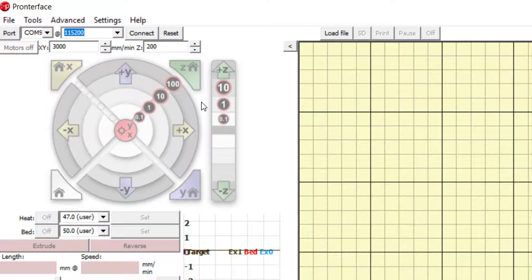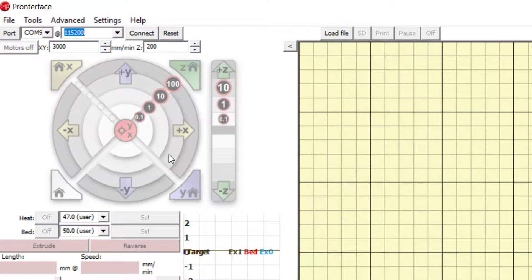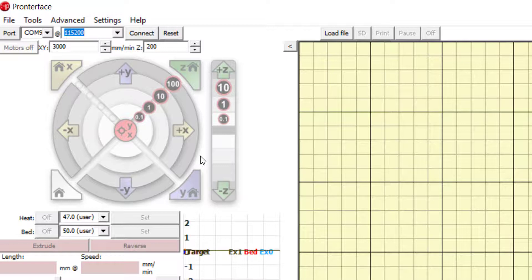You can also move the bioprinter bed in the positive Y or negative Y directions. Note that the movement is relative to the extruder head. So positive Y will move the bed towards you and negative Y will move the bed away from you.